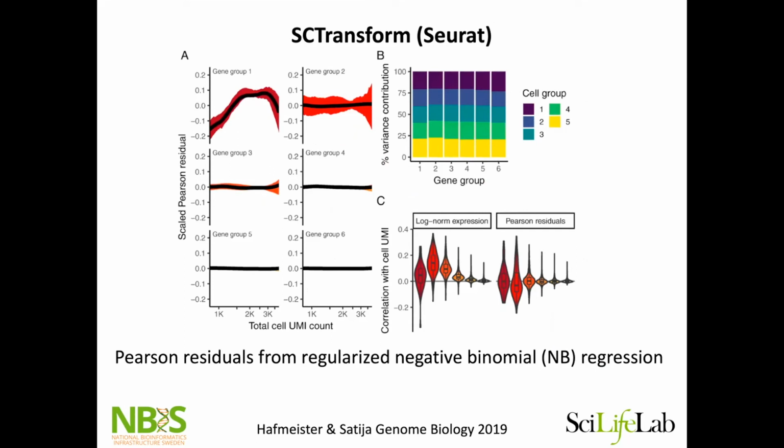What is also really clear when you do this is that at the same time as you do this normalization of the genes, you remove the effect of number of counts and number of detected genes per cell, because then the scaling of the genes will not be as affected by how many detected genes you have per cell.